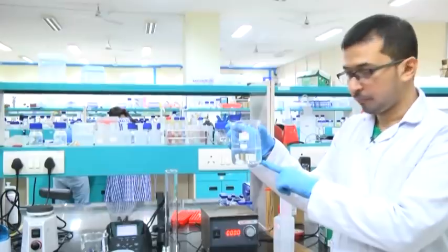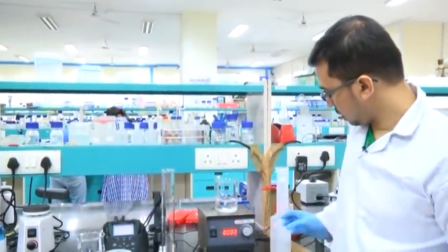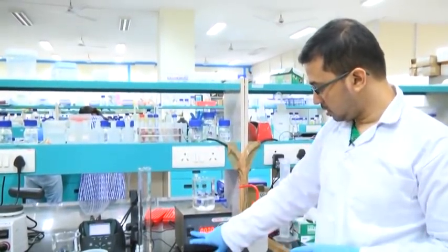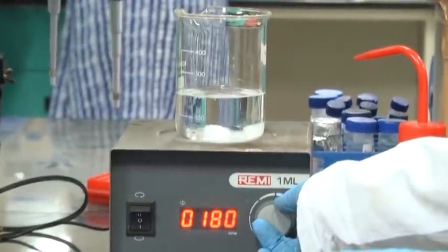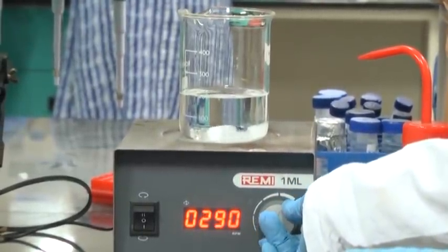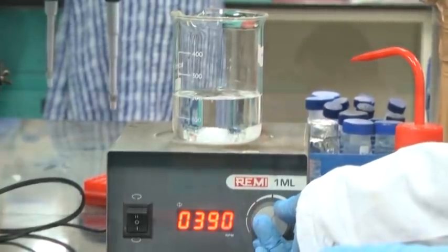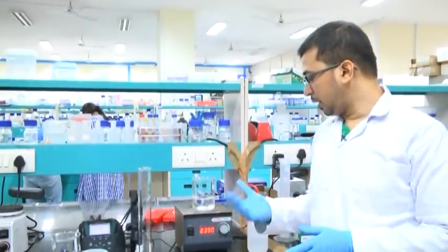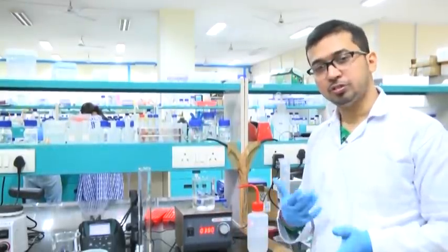Here we have added the magnetic bar and will take it in the magnetic stirrer. I am placing this one in the magnetic stirrer. We have to leave it until the entire solution becomes clear and the solid component is completely dissolved.